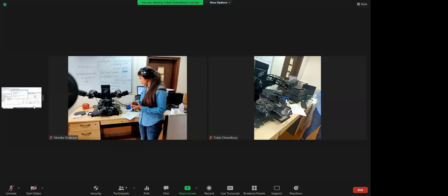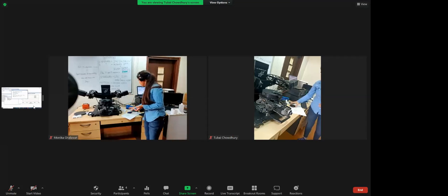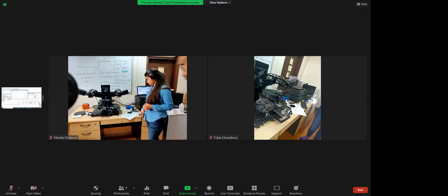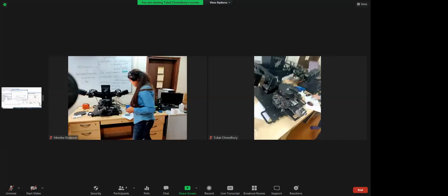I will show you because I have to load another sample again. Just give me one minute. I will load a new sample and I will show you. Subhay, can you just zoom in on it? Hello. Okay, ma'am. I thought someone was asking something.